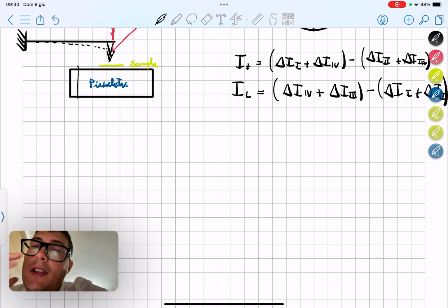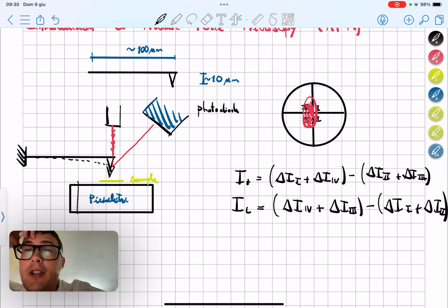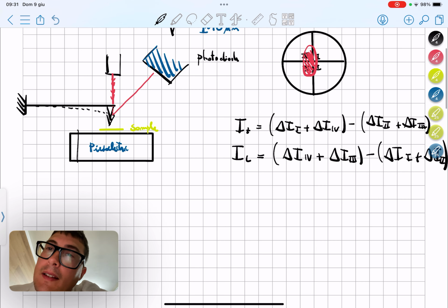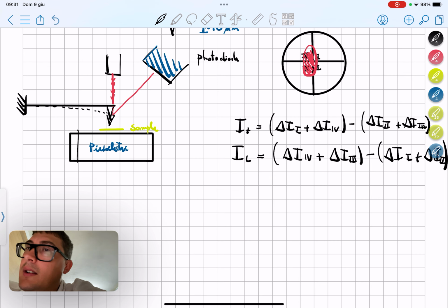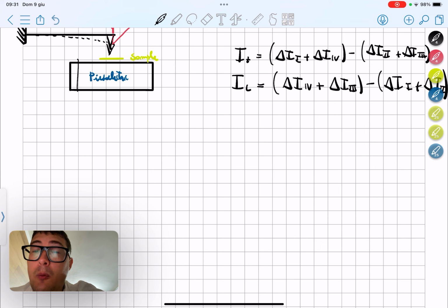But in this video, I would like to start by focusing on the mechanical stresses and strains that a cantilever will experience. This is the starting point before even discussing the types of mode: contact mode, static mode, and dynamic mode, in which we make the cantilever vibrate deliberately at a certain frequency. None of this will be seen here. We will focus on the mechanical behavior first, and once we have understood that, we will move on to other topics.